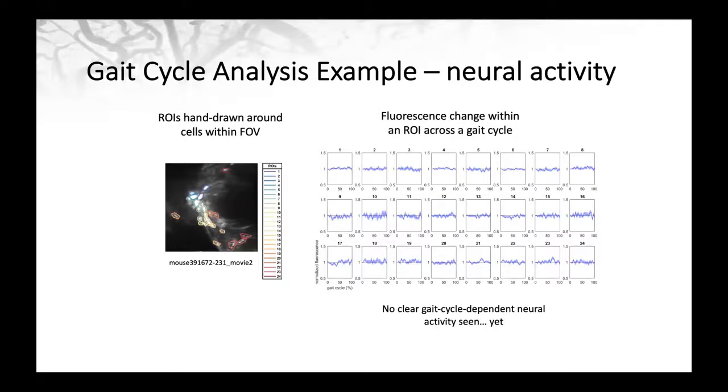So just to summarize, we have the detection optics setup, which is a deformable mirror and new microscope setup. The deformable mirror is used to compensate for the optical aberrations in the spinal cord, including the curvature as well as the myelin. We have DeepLabCut, which helps us easily trace different points of interest on the mouse's hind limb. And in addition, we have the treadmill, which gives us a lot more data on the speed and acceleration of the mouse as it runs.